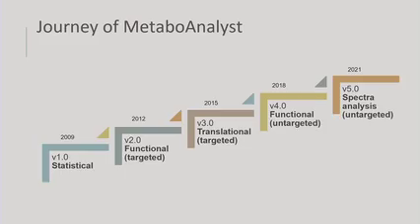So now let's go to MetaboAnalyst. MetaboAnalyst has been around for more than 10 years. At the beginning, we focused on the stats, and at that moment there were no other statistical tools. The motivation was that we wanted to make something useful online. Over the years it became more popular, and then we started asking what's next. So we get the significant features, and we want to do more functional analysis.